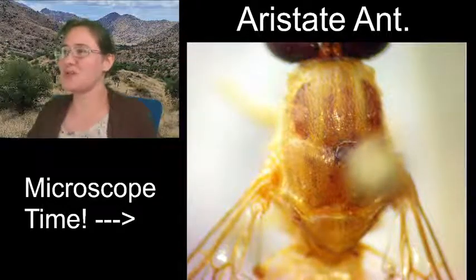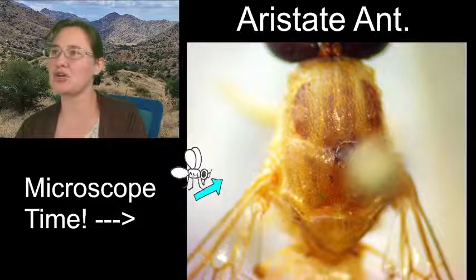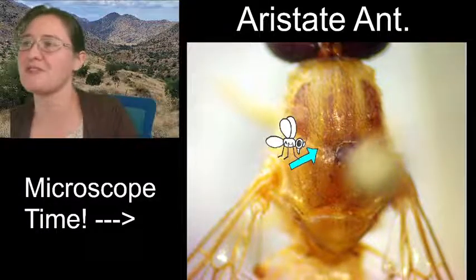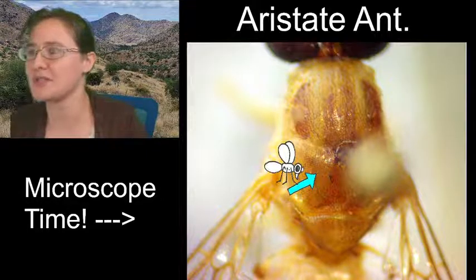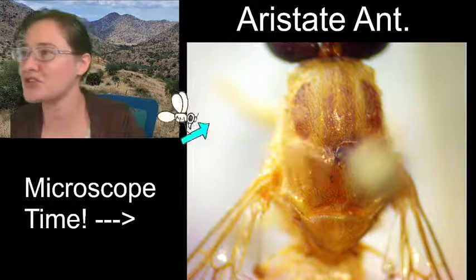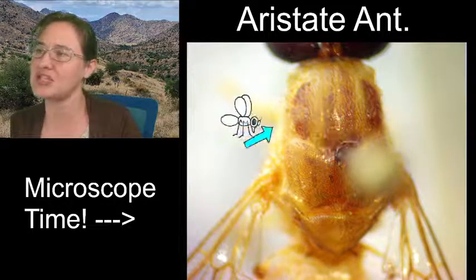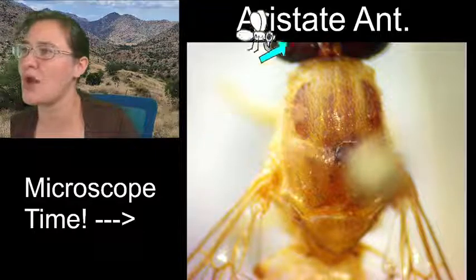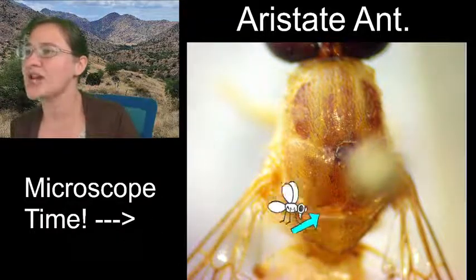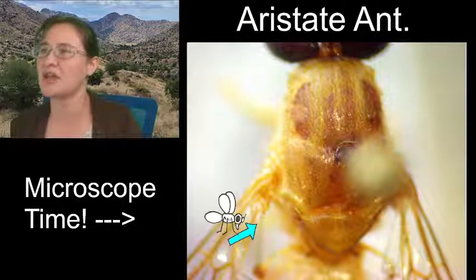Alrighty, so this is what this region of our fly looks like. This little gold shiny thing in the center of the screen, that's the pin going through my fly. So there are some characteristics that are disrupted by that, but it is the best that we can do for now. I want to make sure that we can see the entire region that we're sketching, but if you want, we can go ahead and zoom closer to see some more fine details. We're definitely going to be zooming in closer to check out some of the details down here anyway.